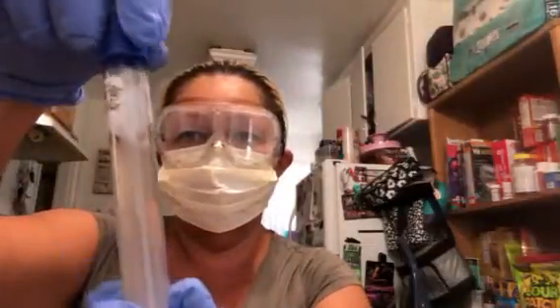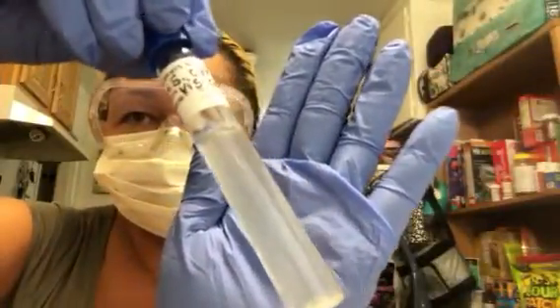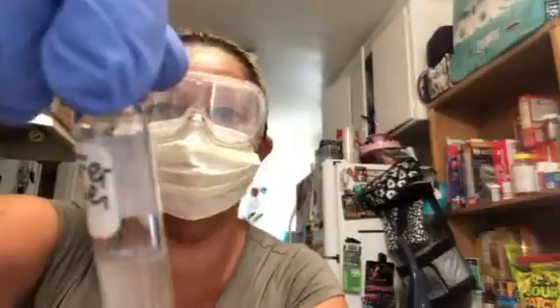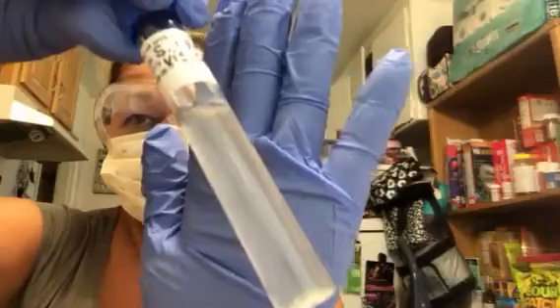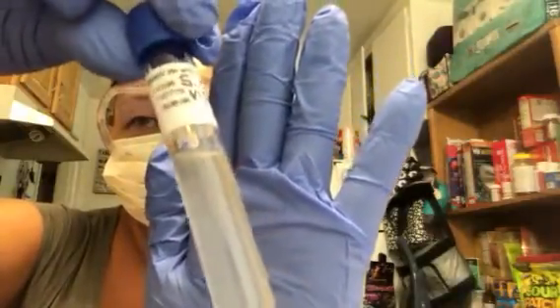It's been 48 hours almost, and I did start to see results. I think the 1% was the most turbid as far as results. So this is for the S. cerevisiae. As you can see, it's definitely turbid. This is the NaCl tube at 1%, the nutrient broth. You can see how it's definitely become cloudy and turbid.